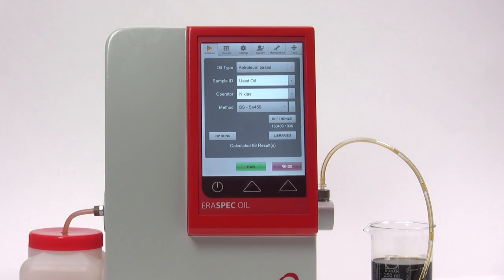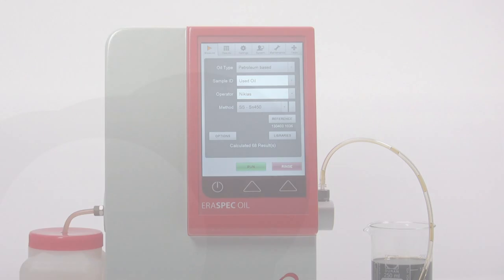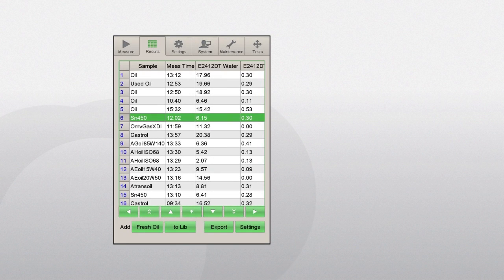Making a measurement using spectral subtraction: if the fresh oil spectrum has been measured on the instrument, it is possible to evaluate the difference between the fresh and used oil spectrum. Spectral subtraction enables more detailed investigation of the degradation and contamination of the used oil.